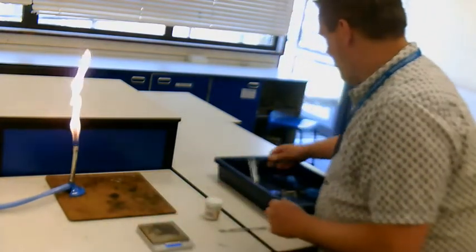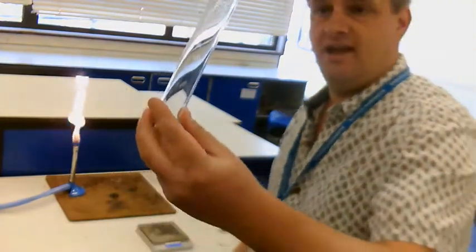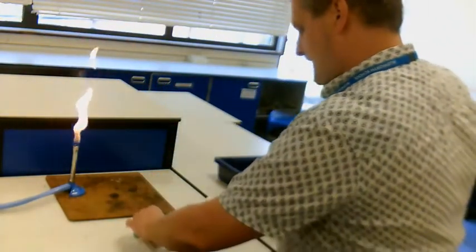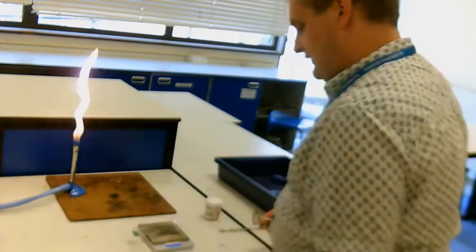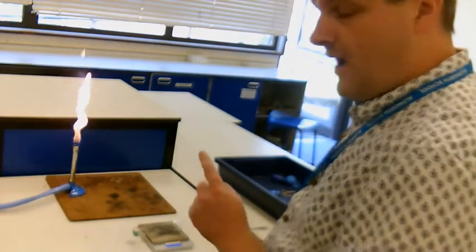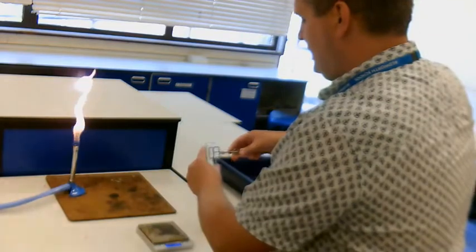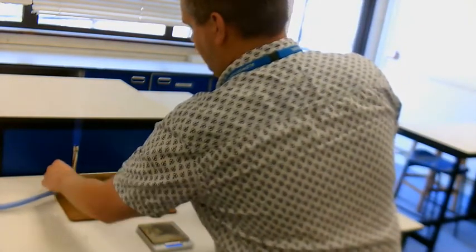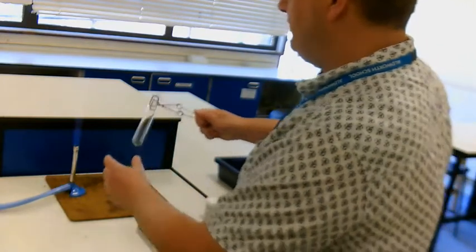So here's one I've already prepared. Literally just a boiling tube with some copper carbonate in the bottom. What I'm going to do is quickly weigh that, and it weighs 32.26 grams. You'll see why I'm doing that in a second. I'm then going to get my flame, put it on a roaring flame, and heat this over the bunsen.